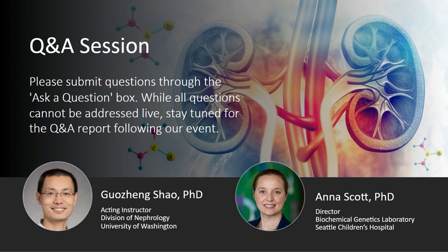Go ahead, Liam. I'll let you manage. All right, so another question here. This one, Dr. Scott, this one's for you. So amino acid analysis using ion exchange and ninhydrin detection is a well-established technique developed in the 50s. What is your view on the advances of newer technologies such as LCMS for amino acid analysis? How do they compare with classical AAA analysis?